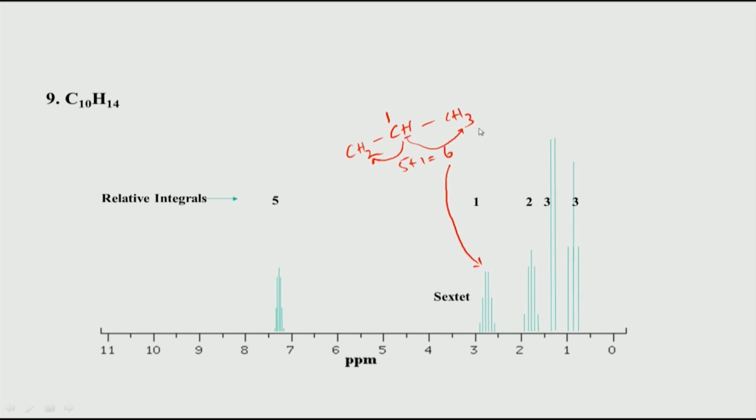Okay. And then if you look at the methyls, there are 2 methyl groups here. Again remember, methyls typically come between 0 to 2 ppm, and there is no oxygen here, so there is no electronegative atom here. That is why you do not see any peak in the 4 to 5 ppm range. So, these are all purely aliphatic spin systems, aliphatic protons, and here you can see there is a triplet, that is a methyl, which means it is attached to a CH2.